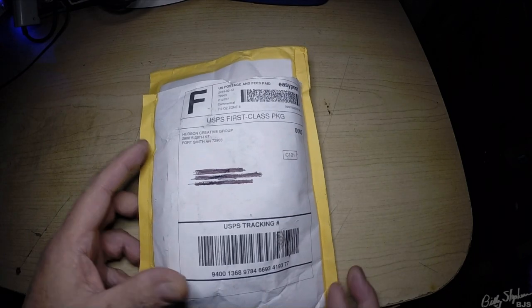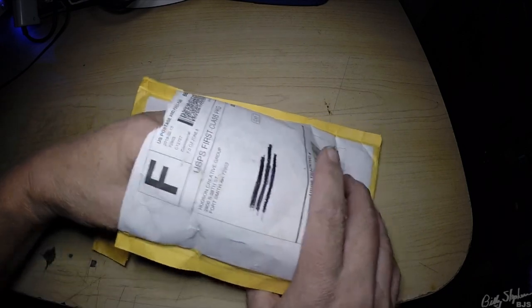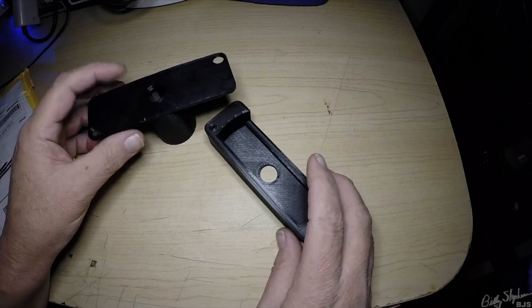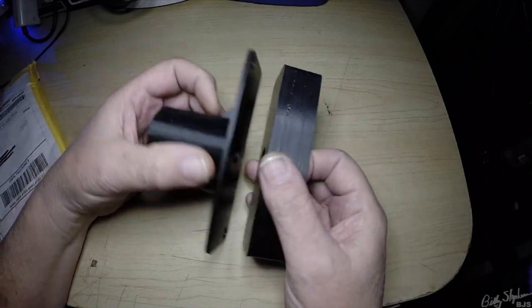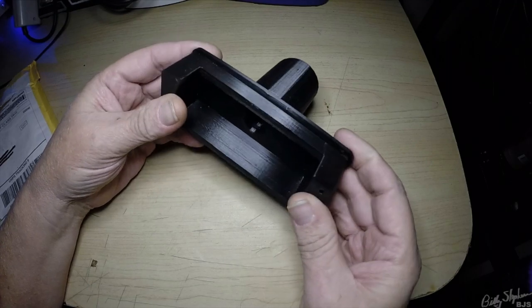This arrived in the mail yesterday, and it has our parts. There they are. They're looking pretty good. I'm happy with the quality — they fit together just right.